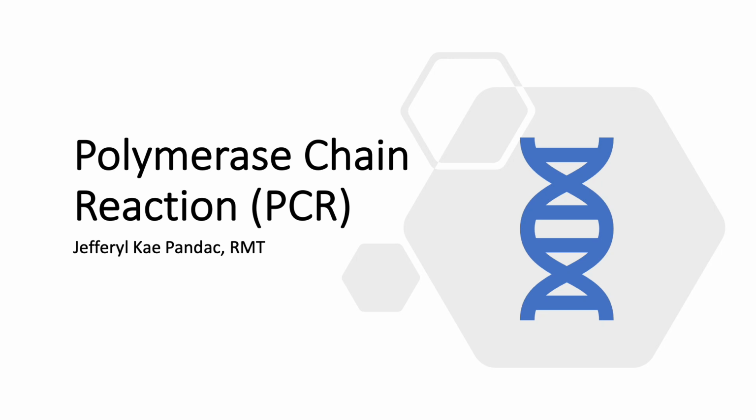Hello everyone. In this lecture, I will talk about polymerase chain reaction, which is one of the most important cytogenetic techniques that you must learn in this course. In this lecture, you will know some basic information about PCR as well as the various types of this essential technique.